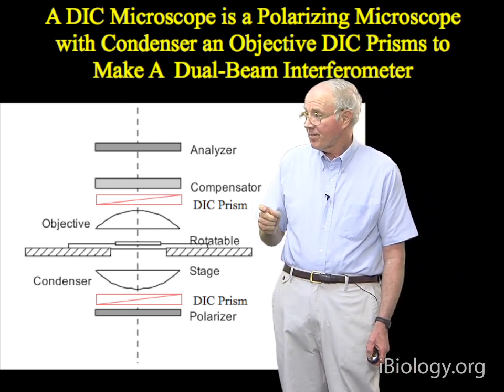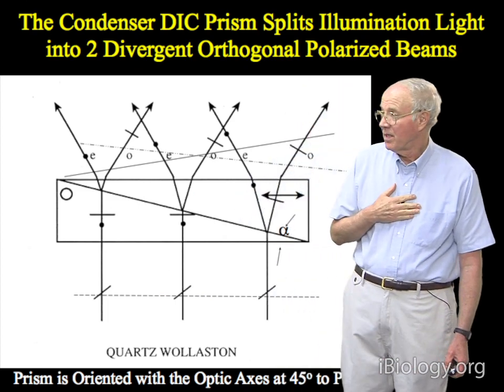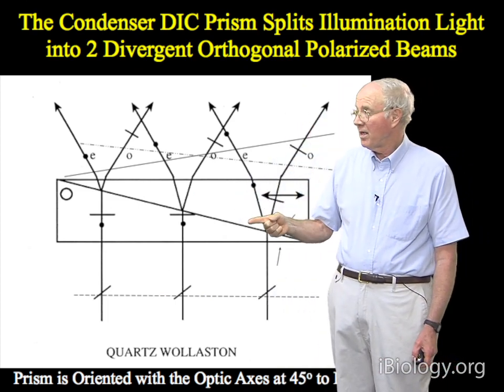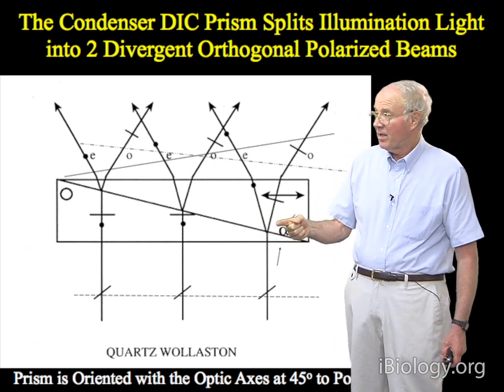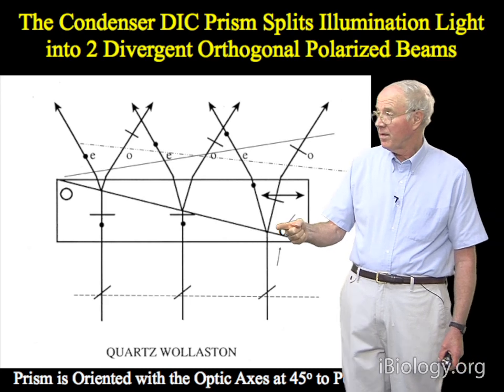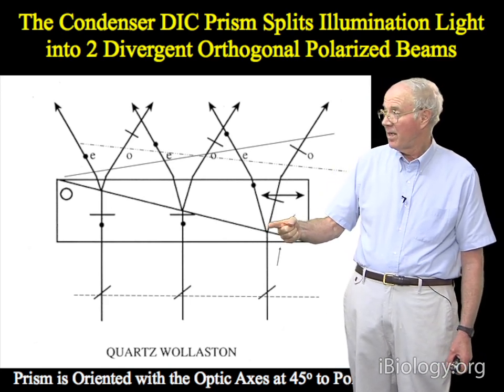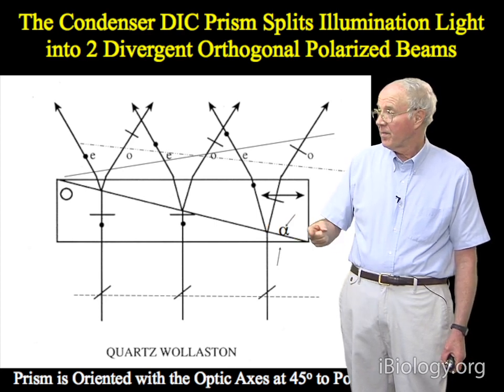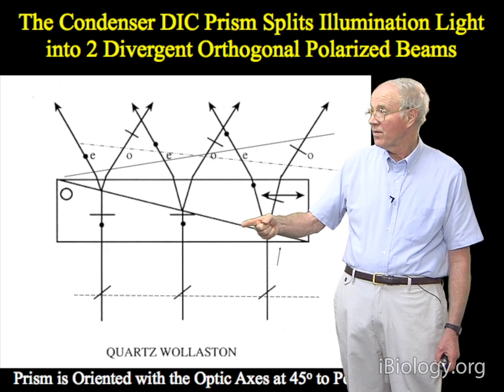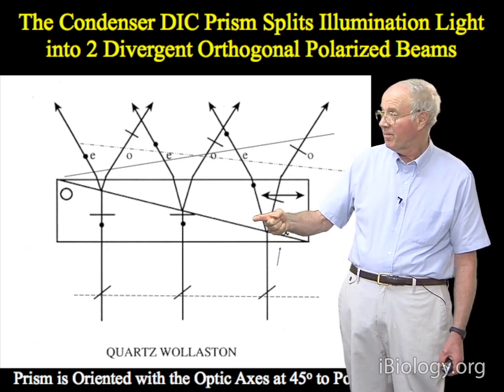Right? And so how do we make the two beams? This is done with the DIC prism in the condenser. Initially, one version of the DIC system, when it was first invented back in the 60s, used what's called a Wollaston prism, and this was put in the condenser front focal plane.